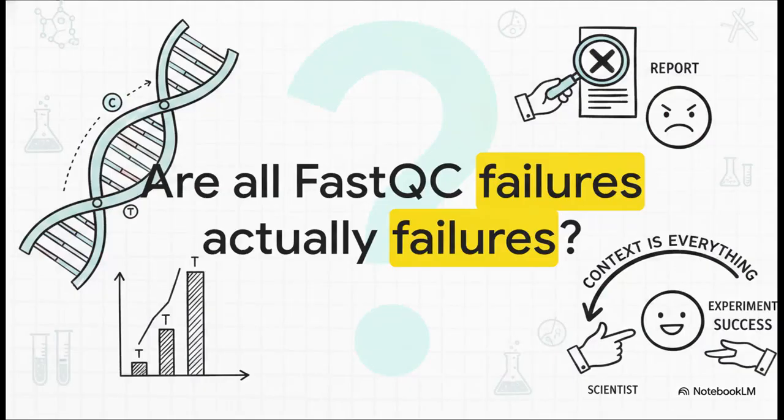This actually brings up a fascinating question posed by the researchers. Are all FastQC failures actually failures? The thing is, the FastQC software has no idea what kind of specific biology experiment you're running. The text gives a great example.